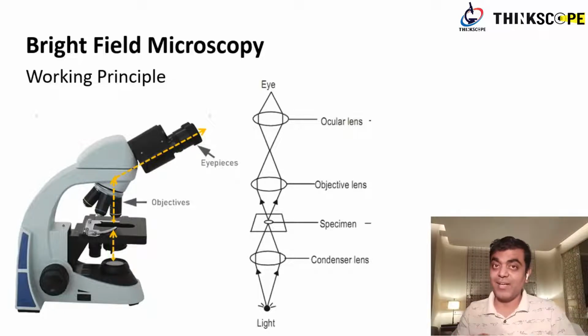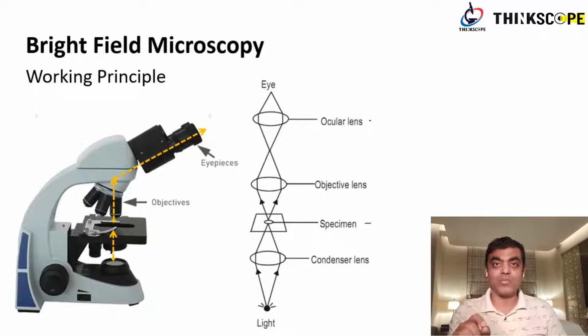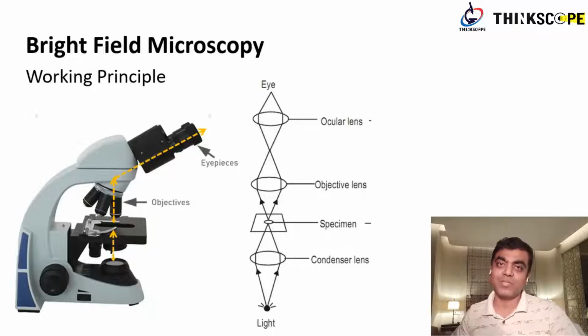LED also is a white light source. Okay, so this is something you should remember. As this is a white light source, you don't have to add any filter. You just have to use the light source. LED light sources even are very small in size, compact in design, so that is why there is growing interest in the customers these days. Most of the places you'll find the old traditional light source have been replaced with the LEDs.